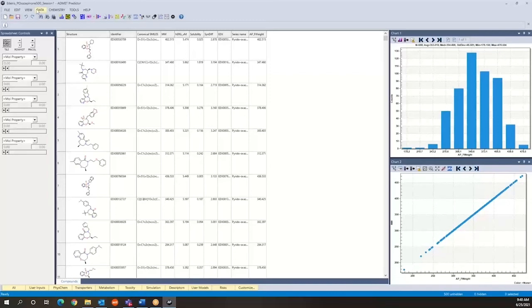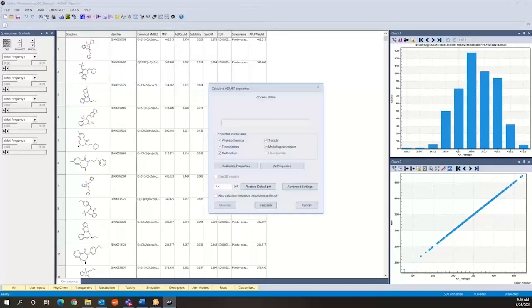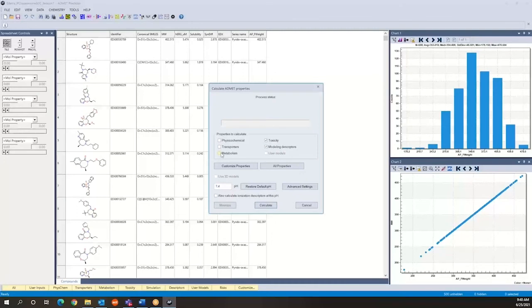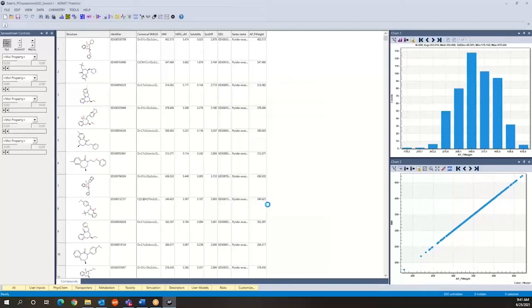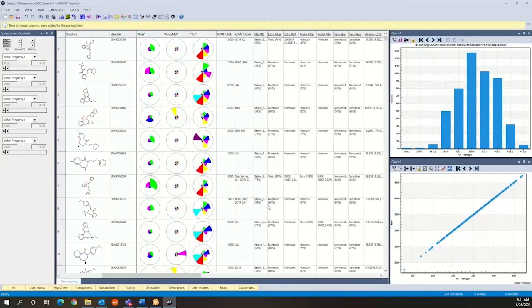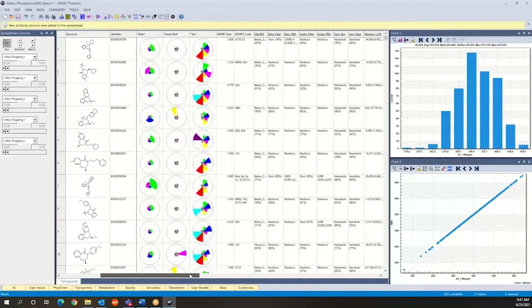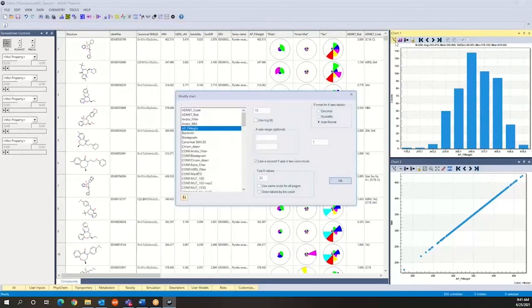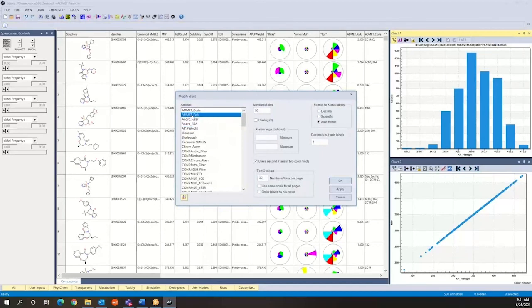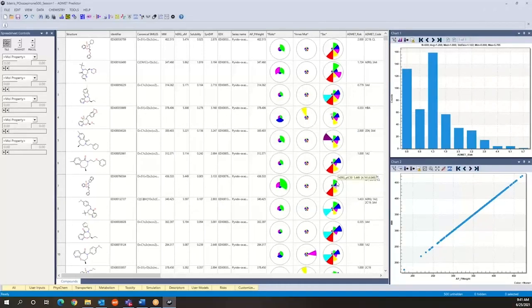Now say we want to calculate certain properties. So in order to do this we go to data and calculate AdMet properties and say we want to calculate only tox properties as part of this exercise. We're just going to go ahead and say calculate. Okay so the program is very fast, actually multi-threaded so it's very quick in calculating properties, and say that we want to make a histogram of say AdMet risk over here so we're going to make a histogram of AdMet risk for these compounds.